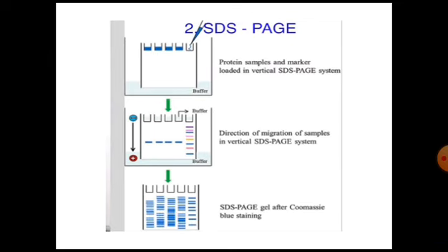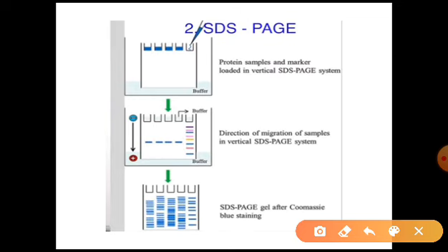Next is SDS-PAGE where sodium dodecyl sulfate is used. With the help of this process, the proteins are separated according to their molecular weight.